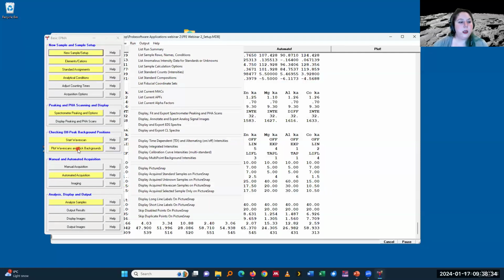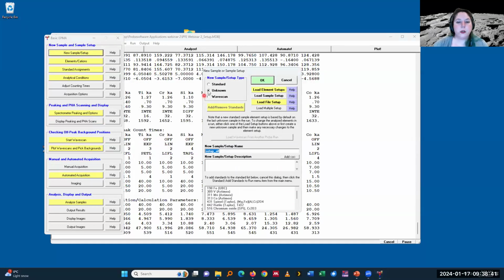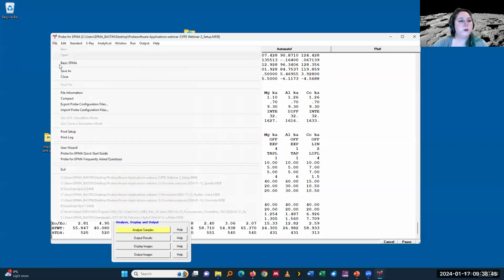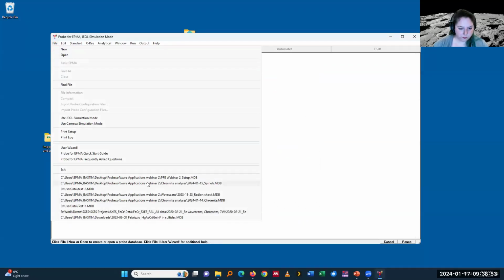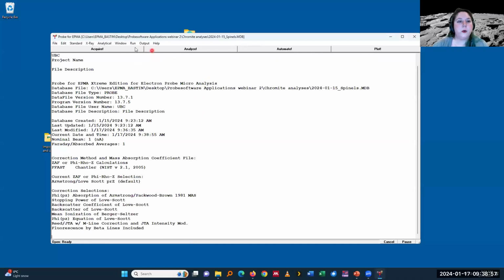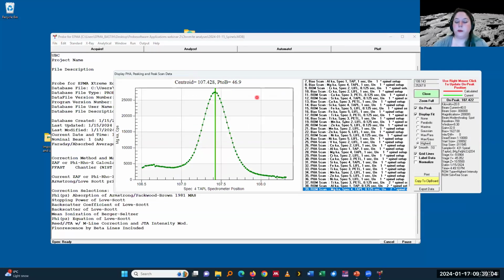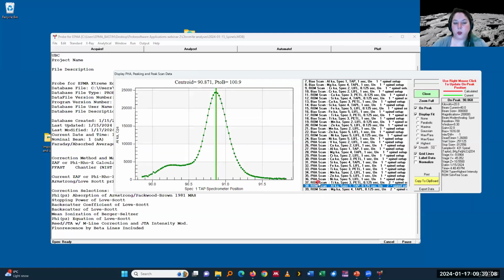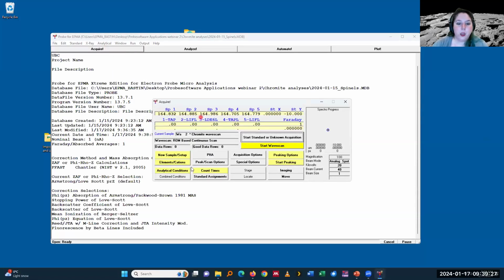And if I just look at the peak scans, I should have loaded, and I just quickly switch, just like in a cooking show, to the actual file where I have data. So then I can look at the scans. I bring up basic EPMA in a moment. The software records everything, and I can look at it and verify what's there. This is really excellent to keep a record, but also to make sure that everything is working as needed.